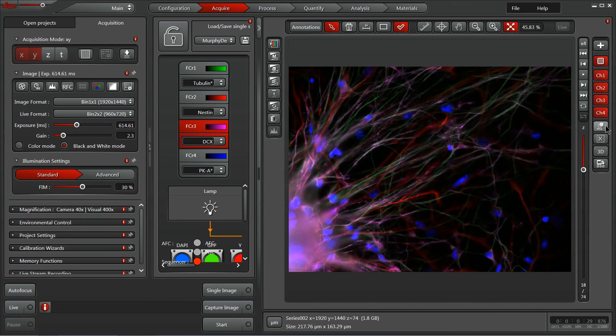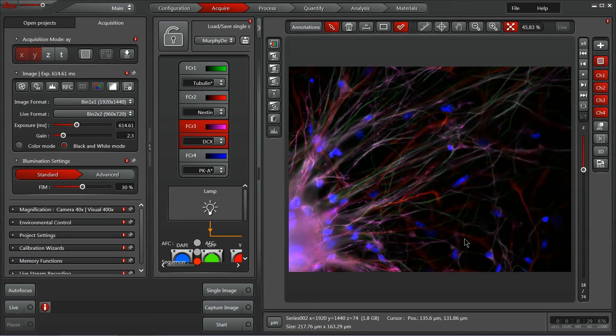You can control which channels are on through these choices here on the right. This also allows us to do a maximum projection, which will take the brightest intensity values for each pixel through the Z-Stack and compress it into a two-dimensional image of the brightest pixels.